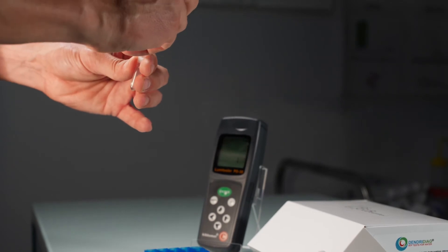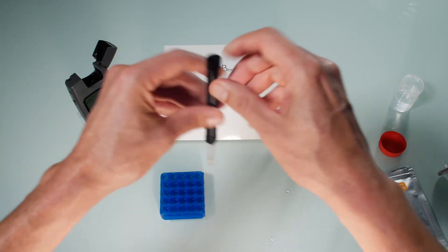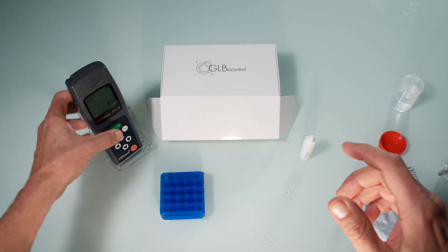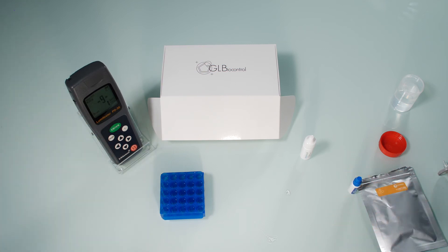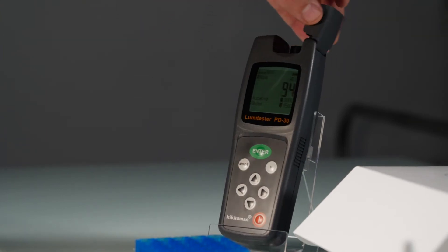Clip the lumi tube onto the end of the tube holder, slightly agitate and place the tube and holder in the luminometer. Close the lid and press enter to start the measurement. The result referred to as value R1 will take 10 seconds. Note it down.